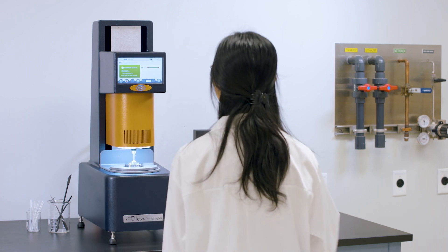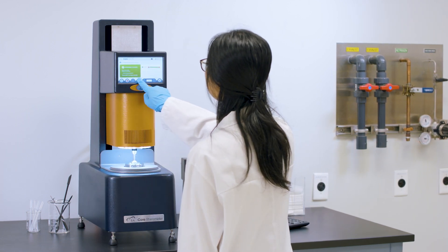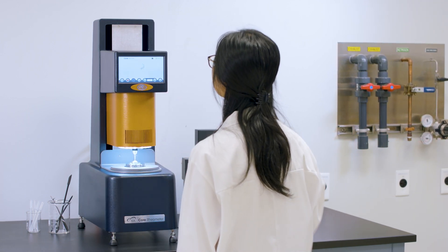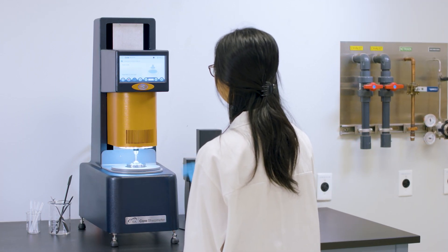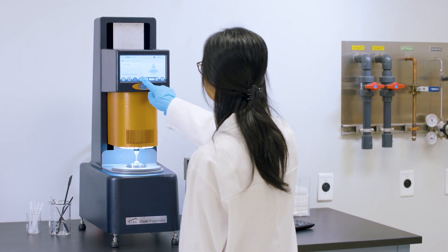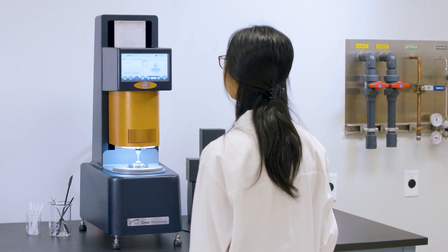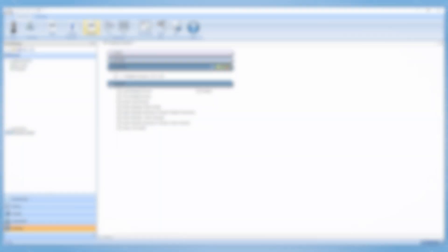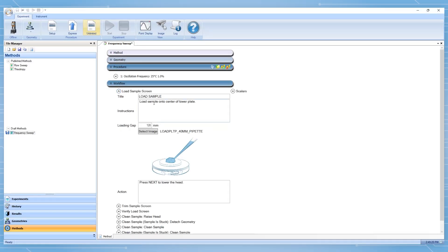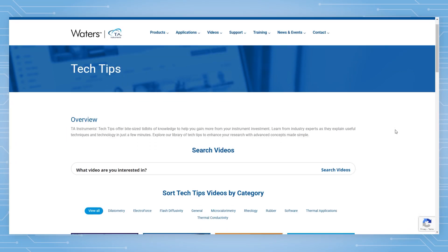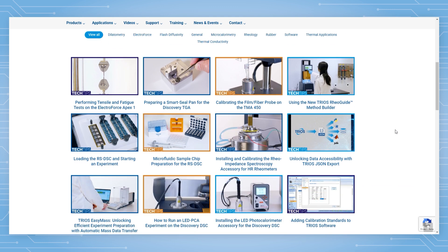The RheoGuide interface enables complete instrument operation directly from the touchscreen through methods that incorporate guided steps and illustrations. Methods are created using the TRIOS method builder and are transferred to the touchscreen, as described in the Tech Tip using the new TRIOS RheoGuide method builder.